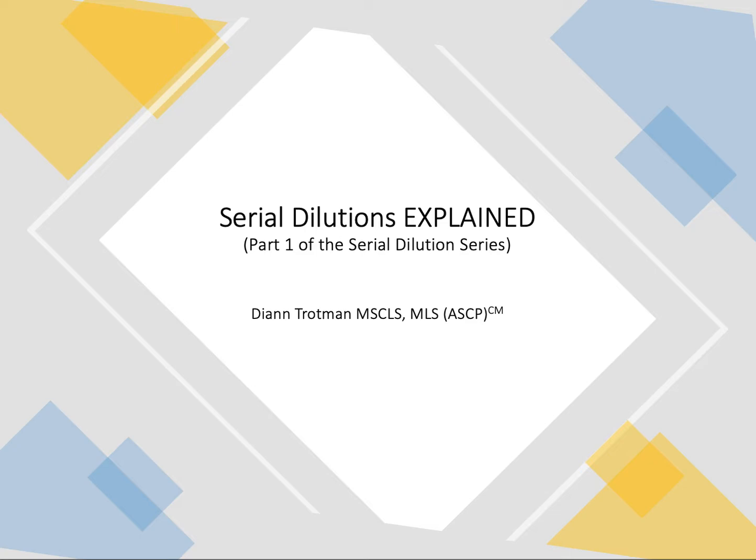This presentation is about serial dilutions. This is part one of a series. It's going to be serial dilutions explained, and then serial dilutions, the math, which will be me with a whiteboard going over serial dilutions and how to figure out the math between the dilutions and the ratios.